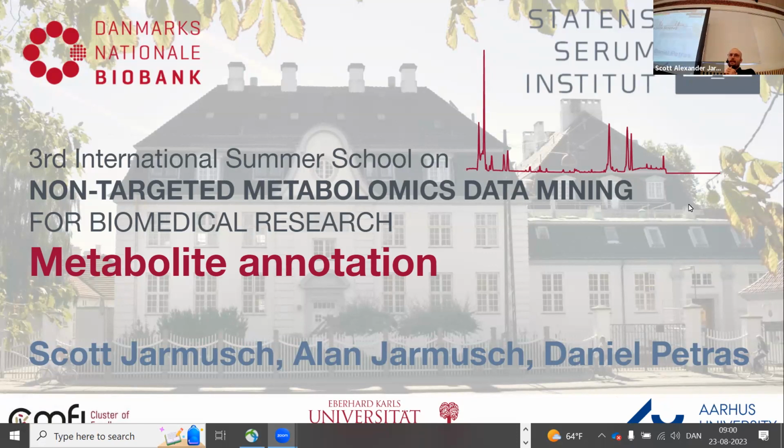So the past couple of days, you guys have had the experience of first day walking through basics of mass spec, some introduction to some of the concepts in FAIR data and all of these processing workflows, quality control. Yesterday, you guys had an intense hands-on pre-processing, an essential aspect to working with any type of mass spec data, especially large types of data. And now we'll move on to the natural next steps today. So this first session, we'll talk about metabolite annotation.